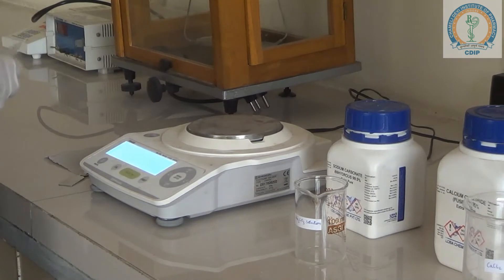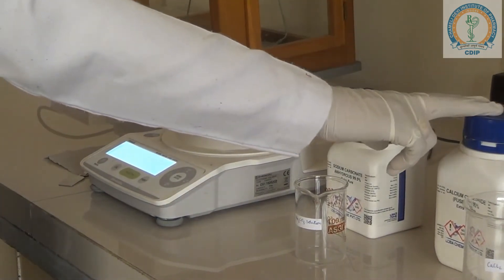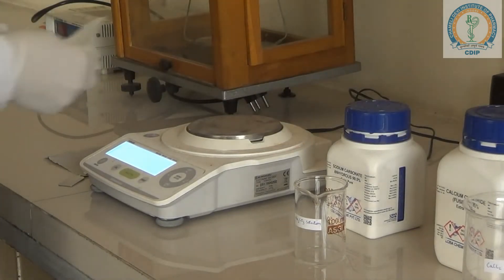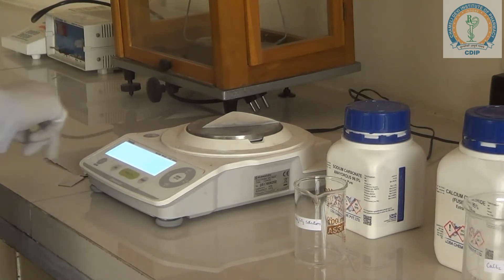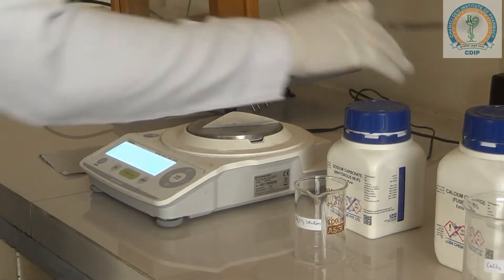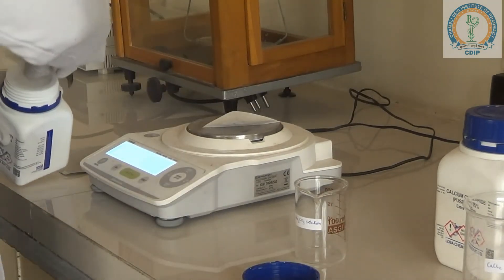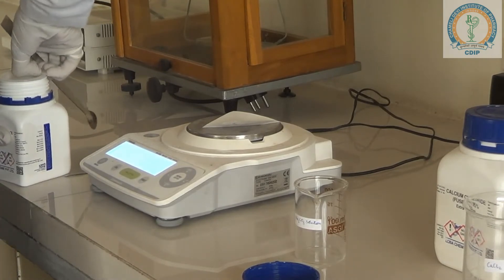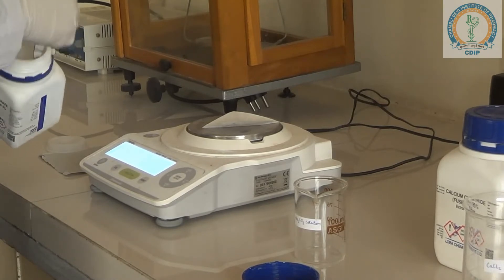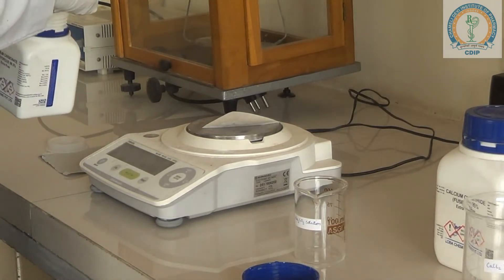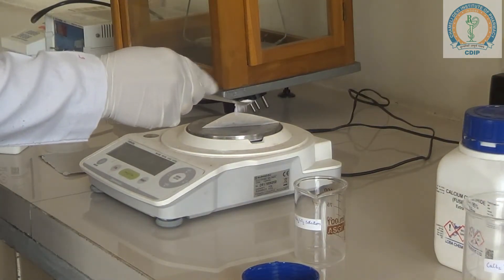Now, for the preparation of calcium carbonate, we first take sodium carbonate 1 gram and calcium chloride 1 gram. So we are weighing this. We are taking here 1 gram of sodium carbonate.